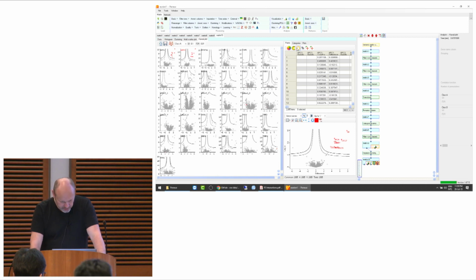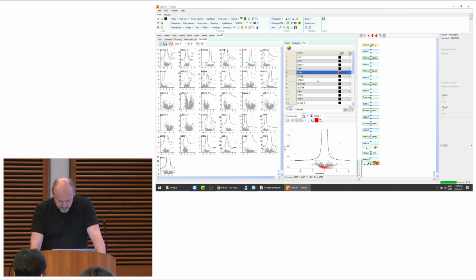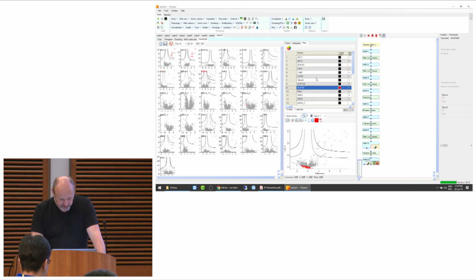Okay, so we can do lots of things here. And you also have plot-specific information here. So here's a table with all of the plots. You can click around, and so you have information on all kinds of levels in these tables. But now you want to go on and define your interaction network from this, right?